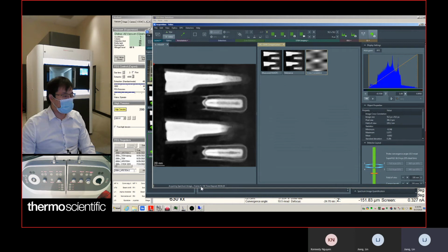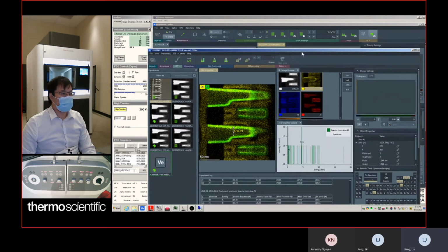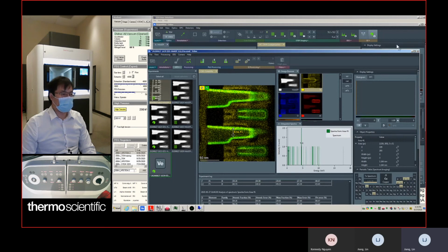We're finished with 5 frames. Right now, if I move the stage, for example to the right, it's hard to tell, so it's just scanning here. Okay, let's take a look at the fitting error.